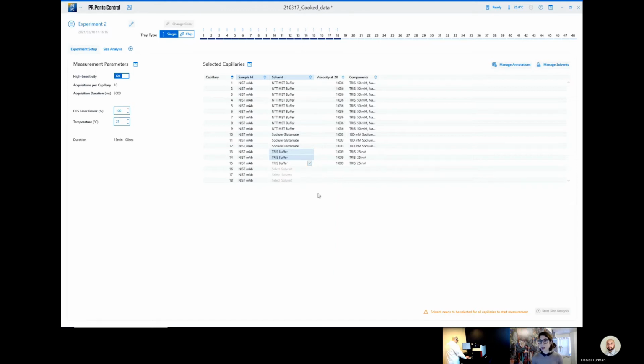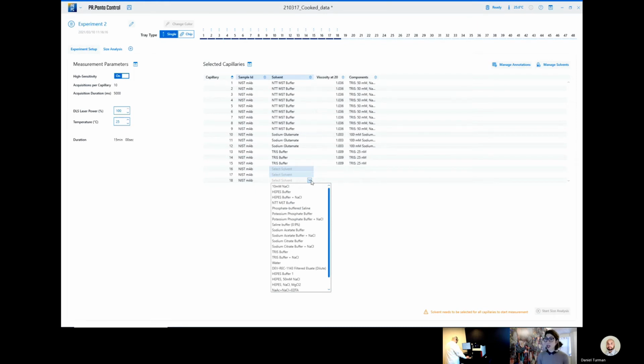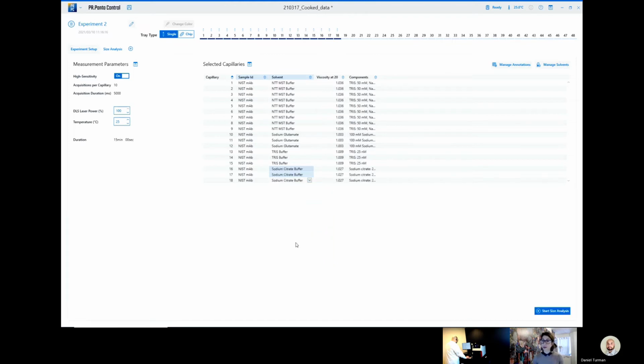And while Dan's filling those out, if you have, say, 48 samples and you already have them in an Excel worksheet for other assays, you can export or copy and paste that data into the chart here. Absolutely, which makes things much easier. This is just a table format.